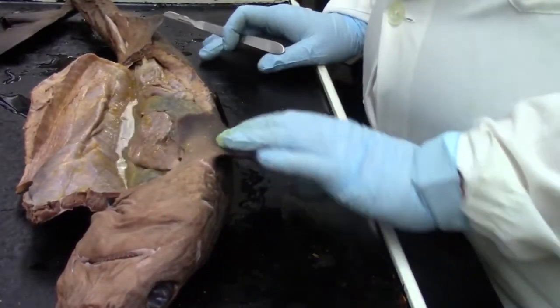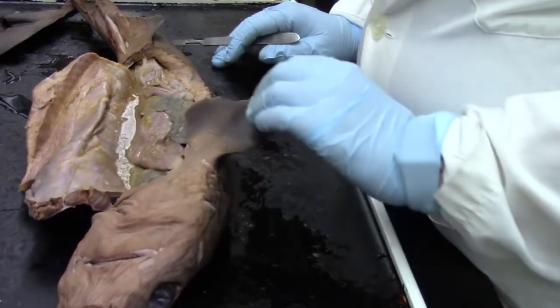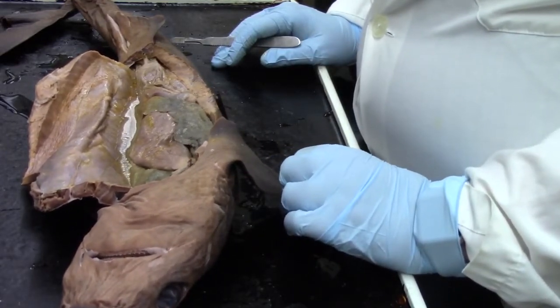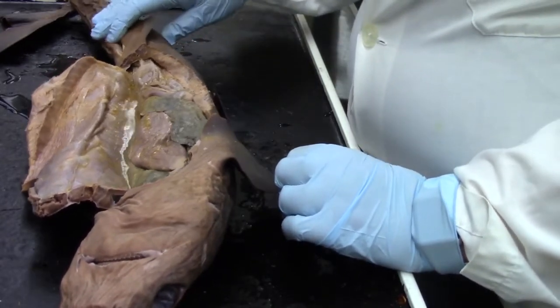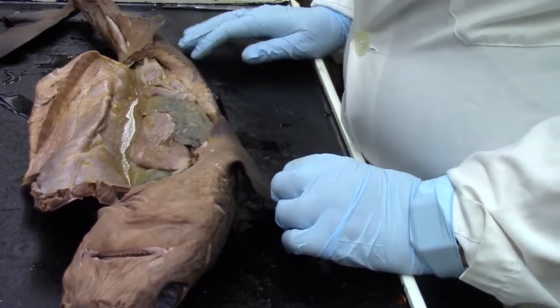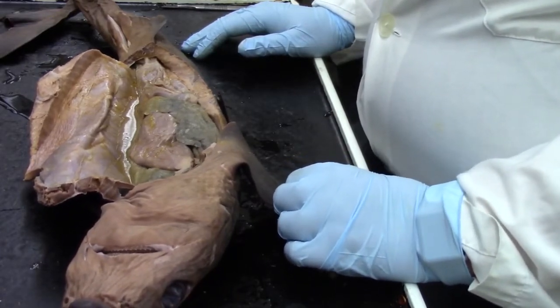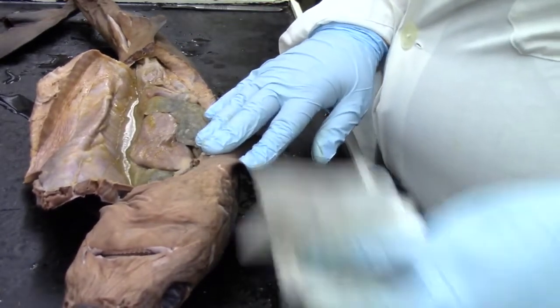So at this point, you may find it helpful to have dissecting pins so that you can pin your fins out of the way. Probably the first thing that you noticed when I opened this is this pooling of liquid here. So this is a little bit of preserving fluid and also some of the natural oils that are coming from the shark's liver. I'm just going to go ahead and get rid of those.